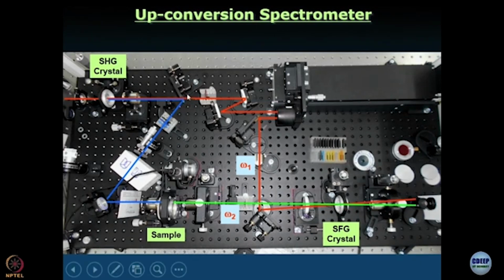So, this is where your red light goes through. Where is it produced? It is produced in the laser outside the spectrometer. If you see carefully, you can see 2 beams, one blue and one red. So, that red light goes through the dichroic, hits this mirror, then this mirror, comes back, and here you have a retroreflector. Retroreflector means it can even be a pair of mirrors, something that turns light back. Light does an about turn at the retroreflector.